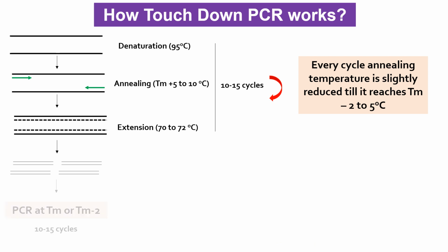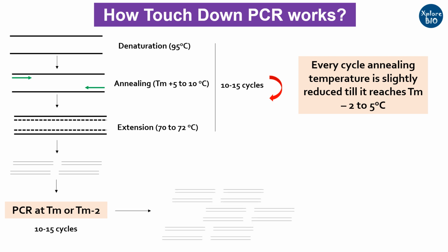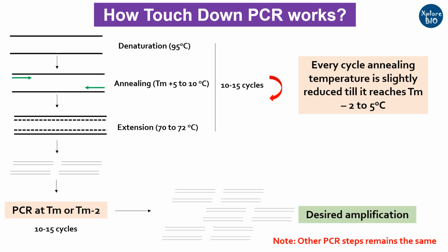The remaining 10 to 15 cycles are performed at lower temperature, at TM or TM-2, during which you increase the chances of PCR amplification while maintaining the specificity. And now, as you have higher number of target amplicons, they will preferentially be amplified more. As a result, you get a specific amplicon as a final product in very high number.